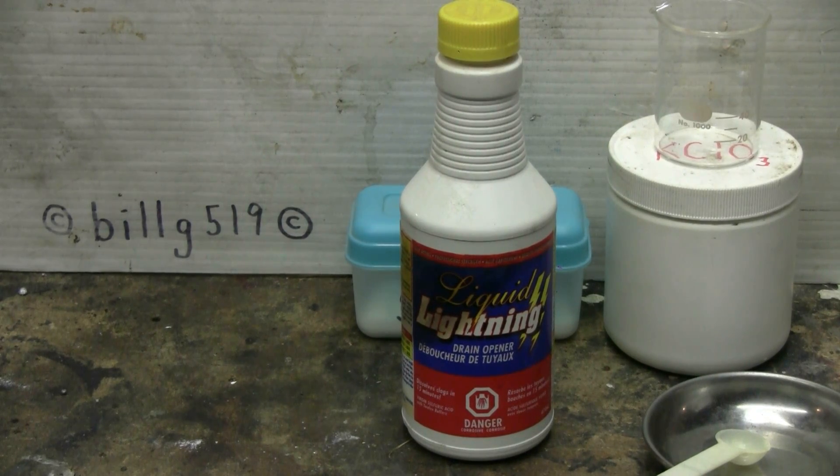At the hardware store, I discovered this drain cleaner called Liquid Lightning. It's supposed to be some kind of concentrated sulfuric acid. One thing this stuff has going in its favor is the bottle — although fairly small, is quite heavy, a lot heavier than a bottle of water would be, and concentrated sulfuric acid is quite a bit heavier than plain water. So I'll do two little tests on this to find out if it really has any degree of concentration or not.